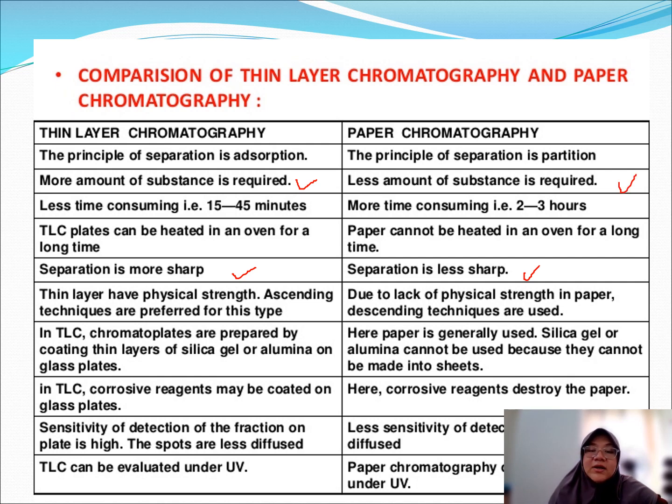Thin layer takes less time, cepat, however paper dia lebih lama, proses dia makan masa. TLC plate dia lebih tahan physical strength, however digunakan paper kan, paper chromatography, so dia kurang tahan lah, lack of physical strength.